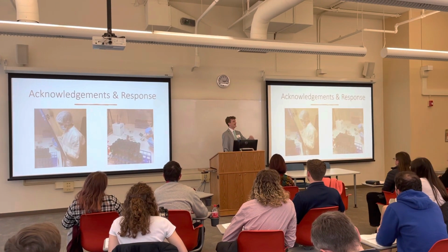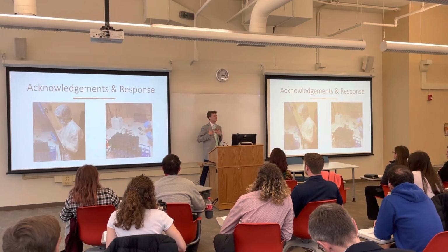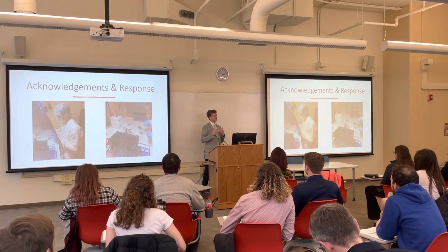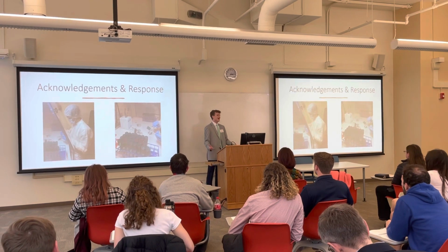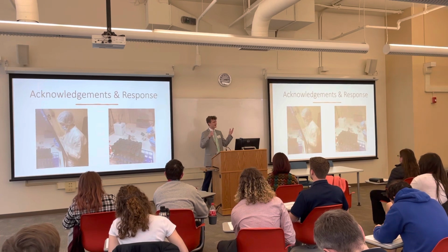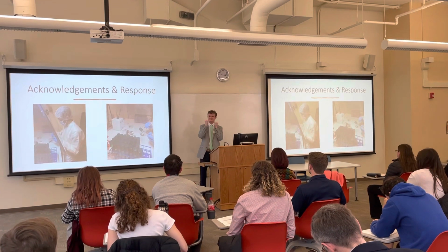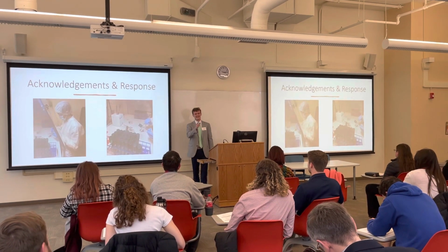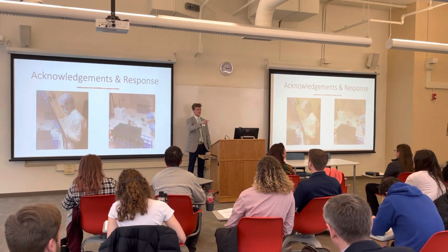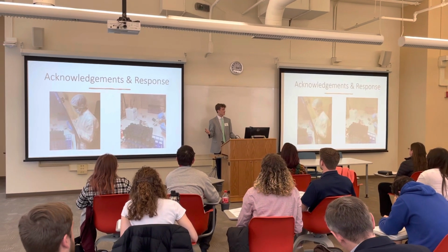It's not fun. Yeah? Did you do any other plant tissue culture before you started working with the bluebells? I like this question. I'm a pre-med student, so no. But my professor managed to, not managed to, I fell in love with it. I've always kept a garden myself, and so doing this kind of thing on a really scientific level, combining my love for gardening with my love for science, it was so exciting. What species did you practice on to get your sterile technique down? Where's my Venus flytrap person? Is she still in here? He's in the other room. Venus flytraps. Those are also buggers, but I love them.